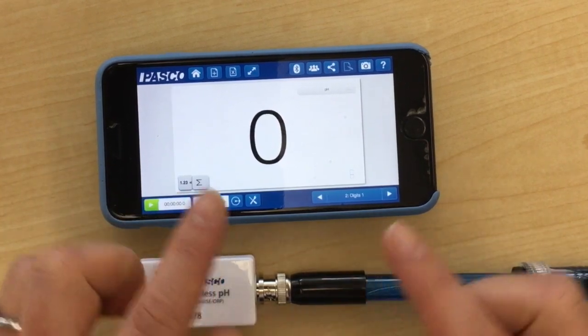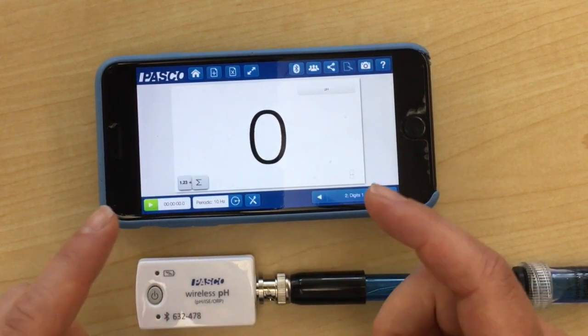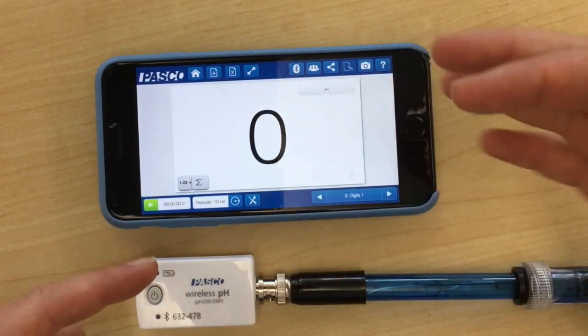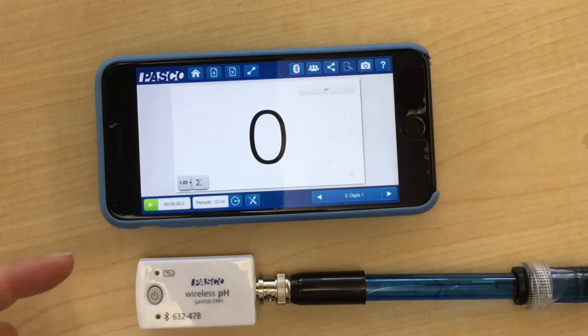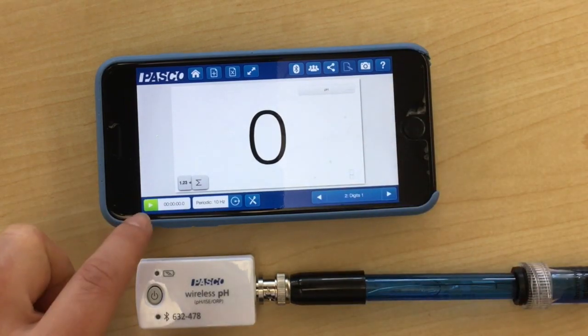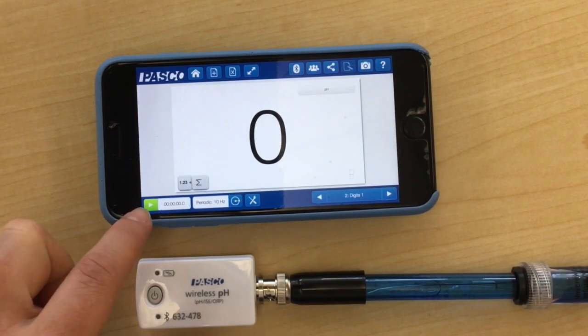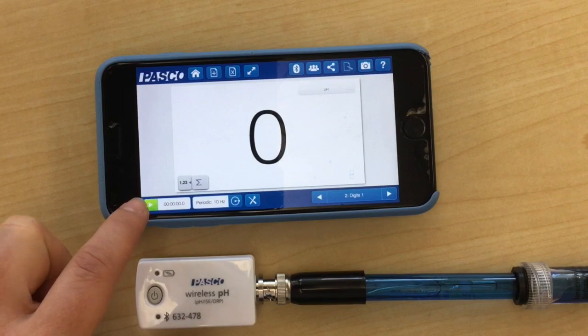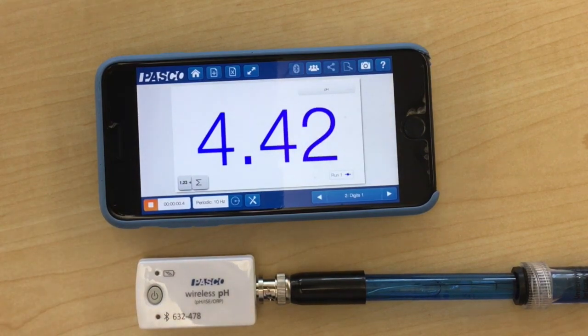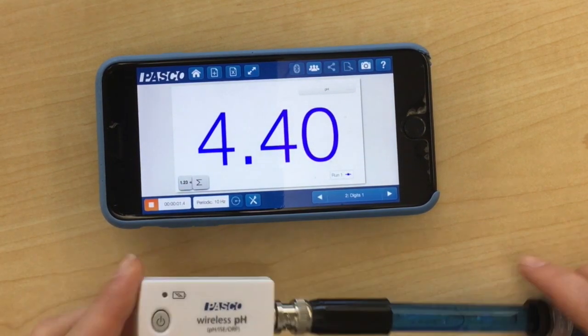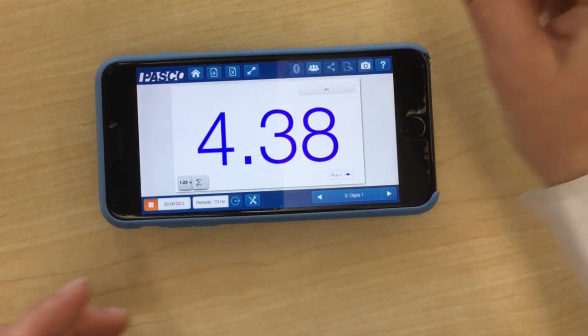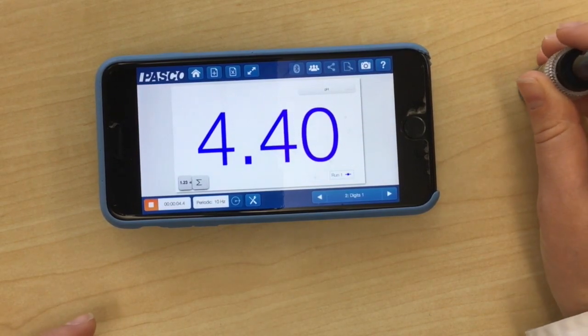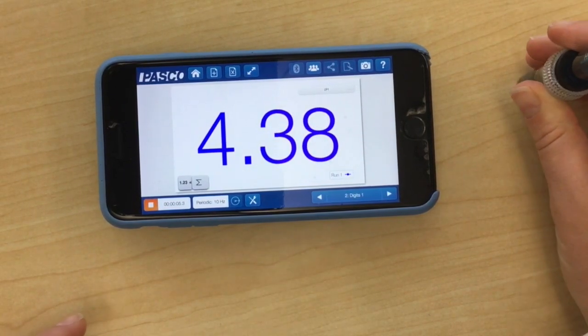In order to start the pH probe taking data, you need to press the green play button in the left hand corner here. Press the play button, and then whenever you stick this into your solution, it will take the pH of that solution.